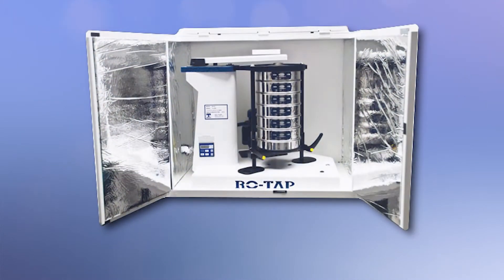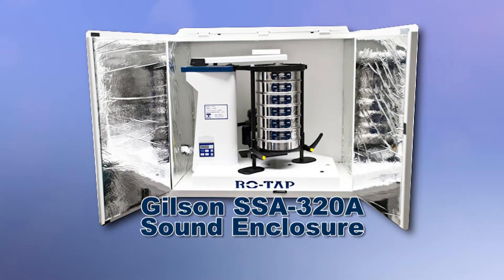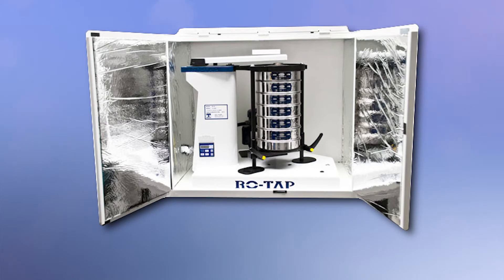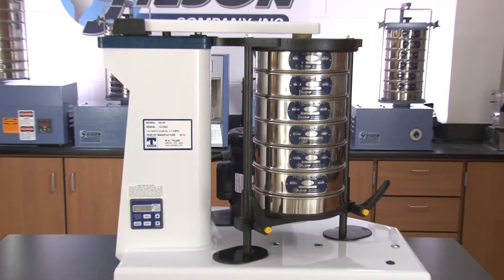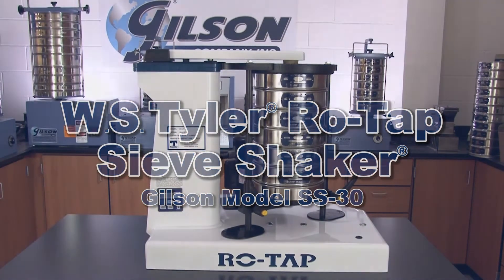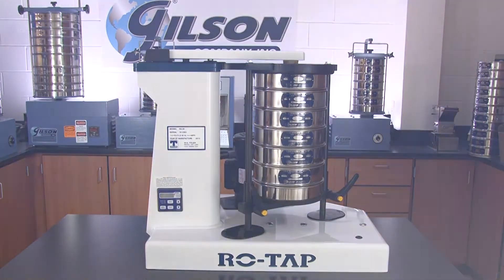And for noise and dust control, the optional Gilson SSA 320A sound enclosure, with its two front doors and top entry panel allowing for easy access and its 1-inch of sound attenuating foam, make the W.S. Tyler RowTap SS-30 sieve shaker the perfect choice for your material testing lab.